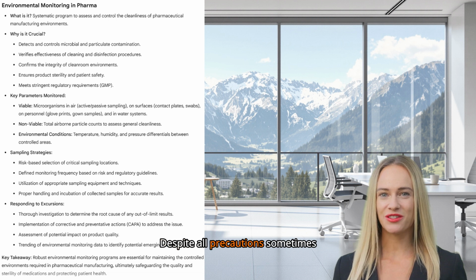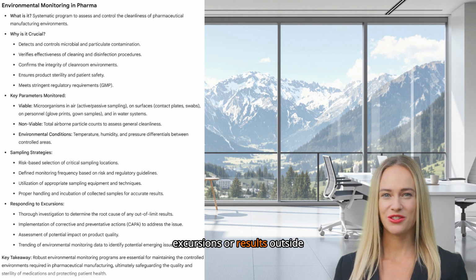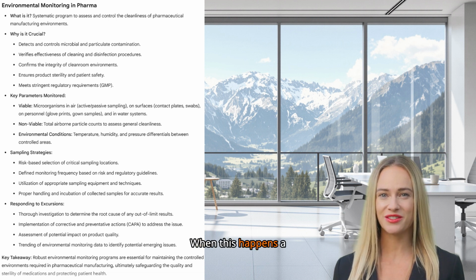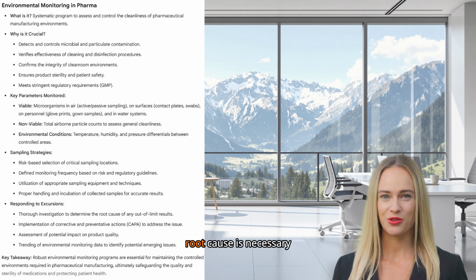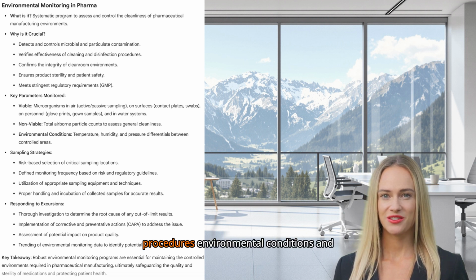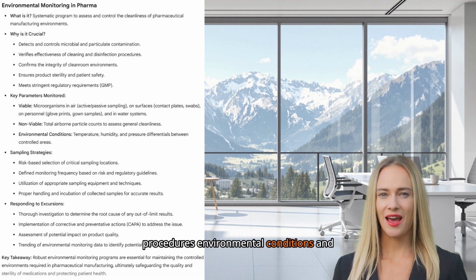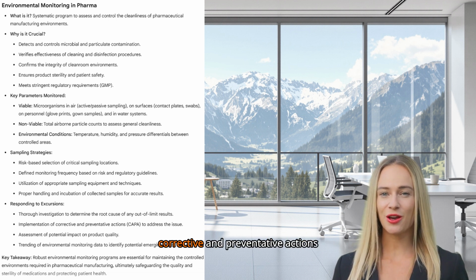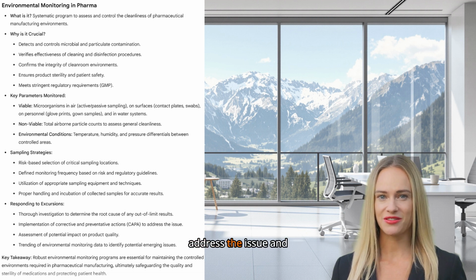Despite all precautions, sometimes excursions, or results outside the established limits, can occur. When this happens, a thorough investigation of the root cause is necessary. This might involve reviewing procedures, environmental conditions, and personnel activities. Based on the investigation, corrective and preventative actions, CAPA, are implemented to address the issue and prevent future occurrences.